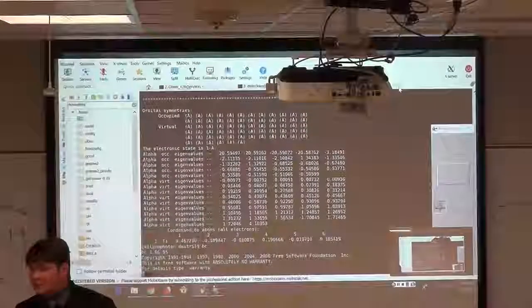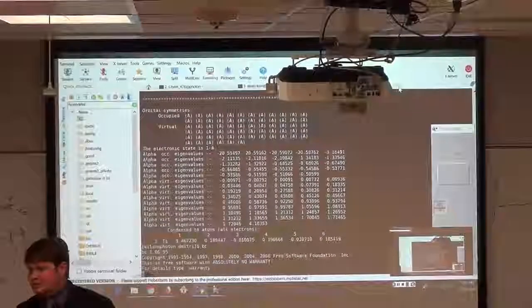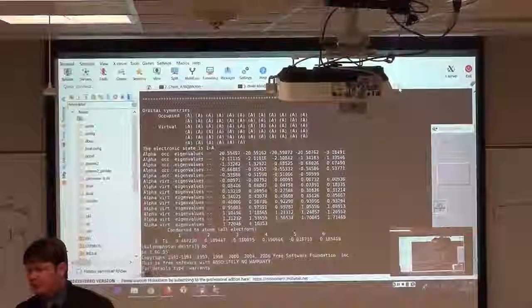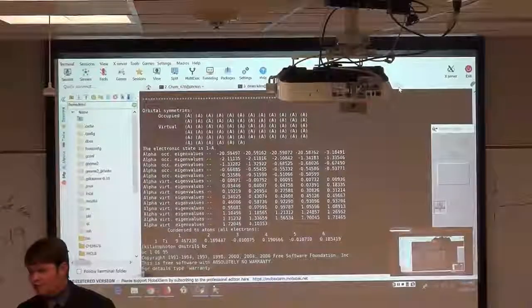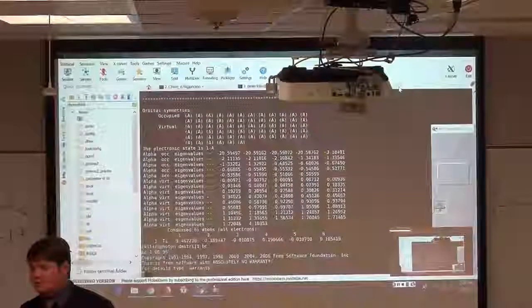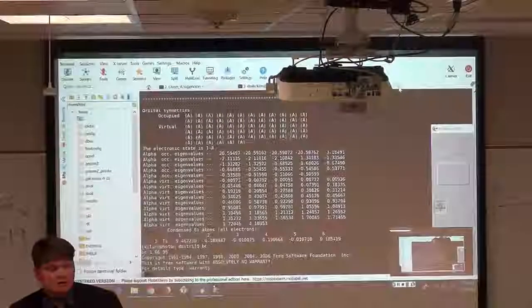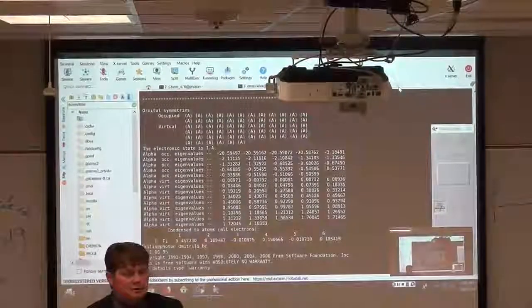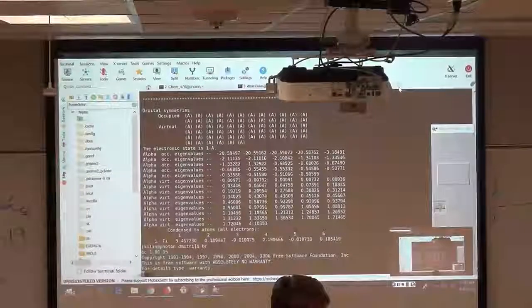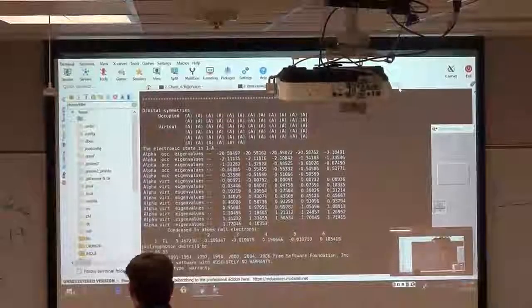So white means it equally reflects all colors, right? If it were absorbing some portion of the spectrum, you would see a color. So it's not color sensitive from the human point of view. Okay. I got lost how we decided that it would be in the ultraviolet range.